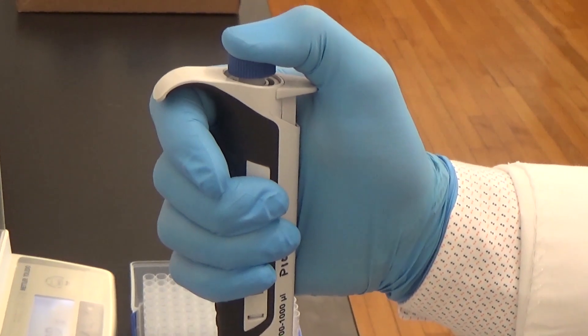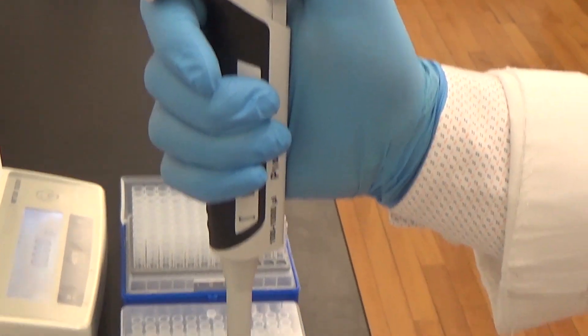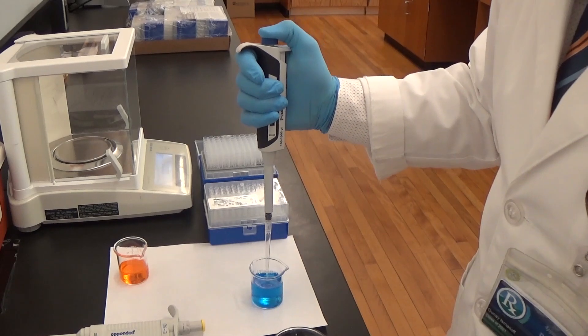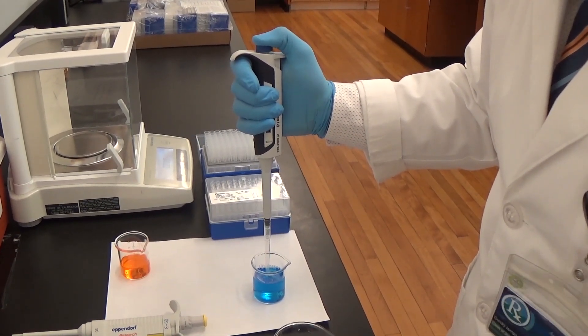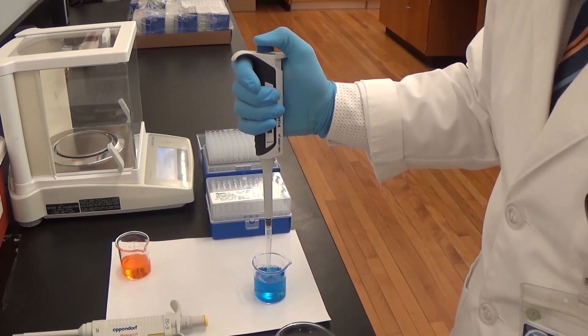Depress the plunger button to the first stop. Dip the tip just under the liquid surface about three millimeters to pre-rinse the tip for at least three times. And then slowly release the plunger button.